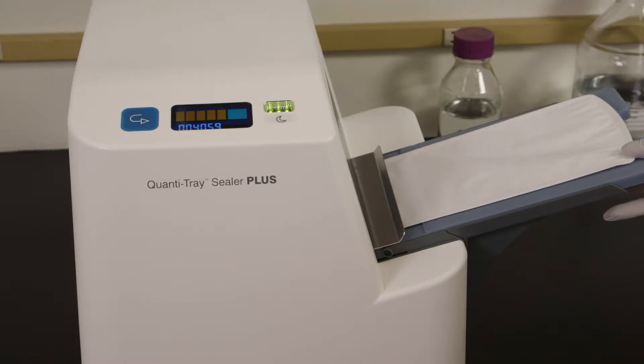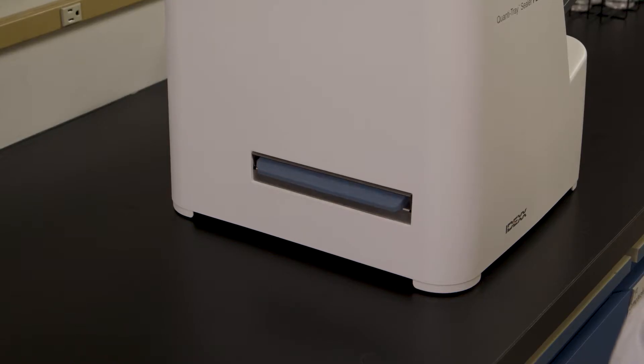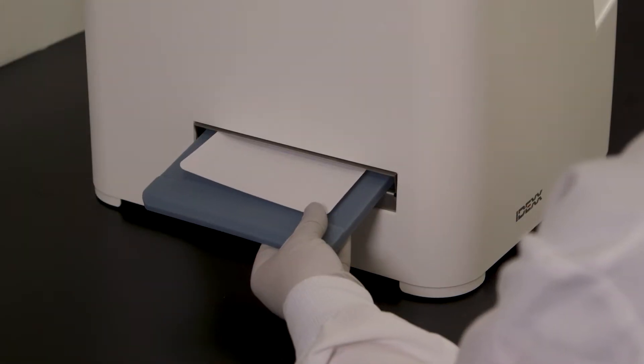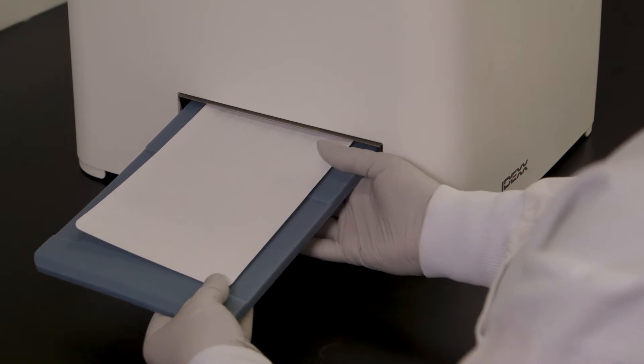If you need to reverse the motor, press and hold the reverse button. However, do not reverse the motor if the rubber insert is completely inside the sealer. The sealer distributes the sample mixture into the Quantitray LEGALERT wells, seals the wells and partially ejects the sealed tray. Remove the rubber insert and tray from the sealer.